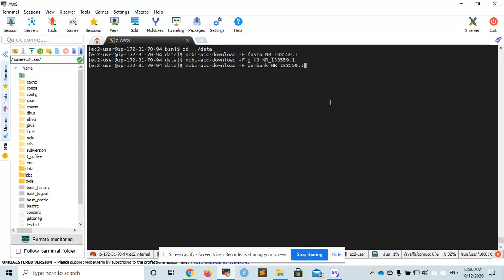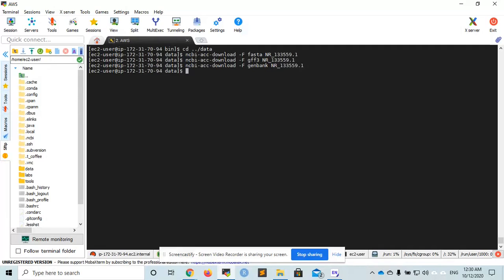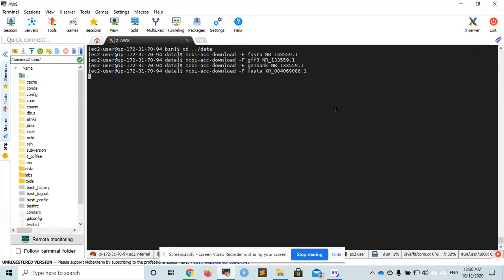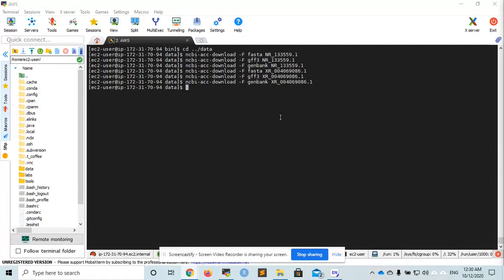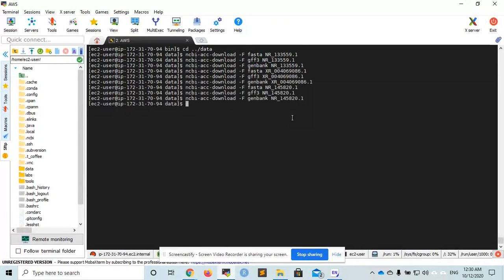First, I will use NCBI ACC download to download the FASTA, GFF, and Jankman files for three different species: Homo sapiens, Gorilla, and Drosophila melanogaster. You can look more about each of these sequences by searching for the code in NCBI.